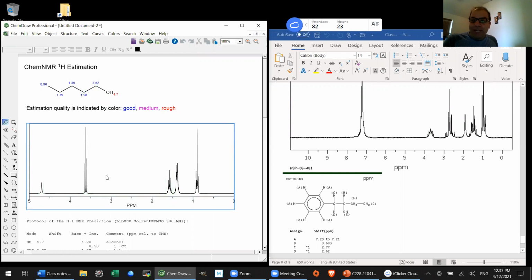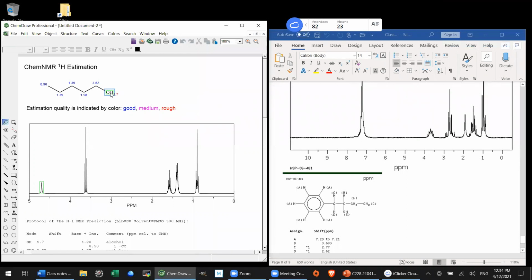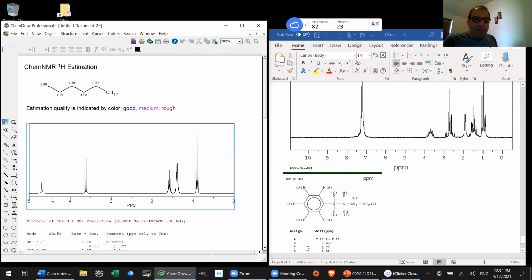And that's pretty common. The reason that OH protons usually don't split adjacent protons is because OH protons, really any type of proton that's protic, so attached to oxygen or nitrogen directly, undergo very rapid physical exchange, meaning that faster than the NMR timescale that it requires to take the spectrum, they are literally moving from molecule to molecule. They're literally getting swapped between molecules. And so for that reason, it's very commonly the case that OH protons will not split or be split by adjacent hydrogens.